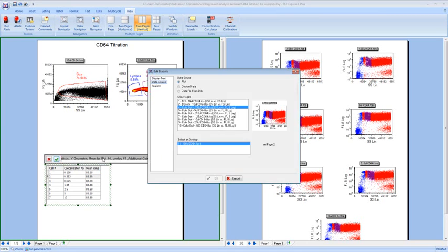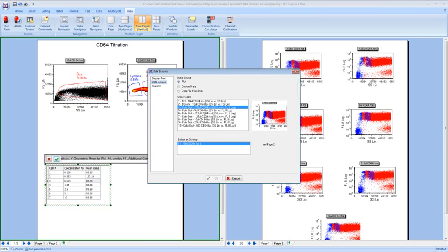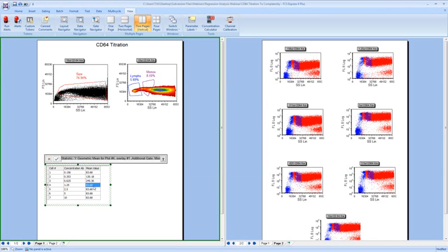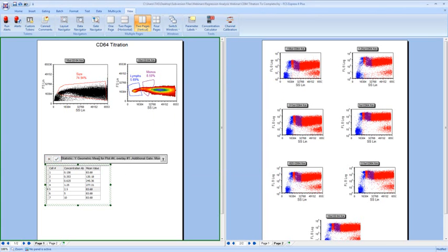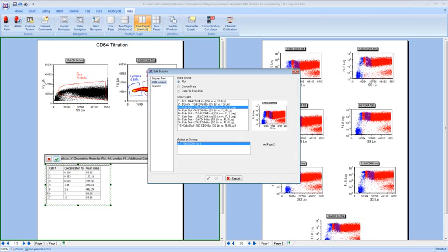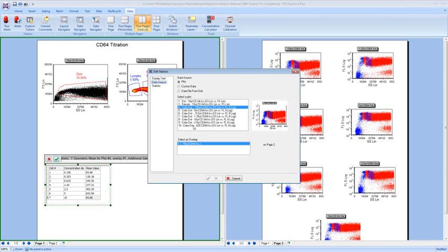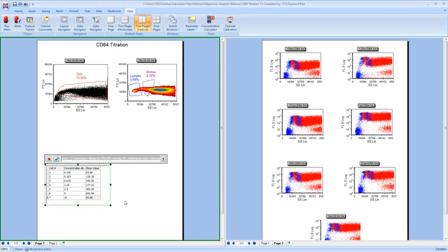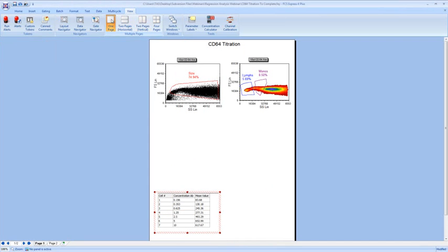And we'll just change these samples quickly to the correct plot, and that's going to give us our titration curve here once we're done doing this. So just bear with me for one moment while I complete the custom data table here. Alright, so we'll choose the last sample, 10 microliters. So now we have our custom data table ready, and we can go back to our one-page view. Since everything's based on tokens, we probably won't have to go back to that second page.